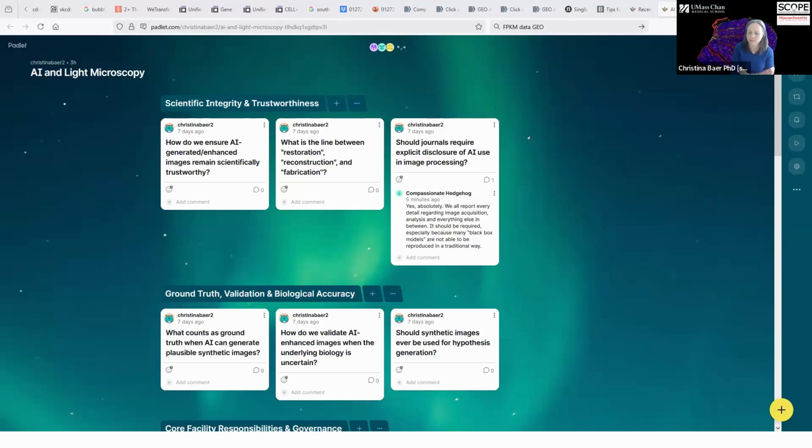Well, when we first started doing deconvolution, there was a lot of skepticism. It's like, how do you take these out of focus images and somehow make in focus images? It's clear magic. And vendors that didn't do deconvolution cast aspersions on people who did. But yet it's become accepted partly because we can see all the math, and people have worked out a couple of different approaches to it.